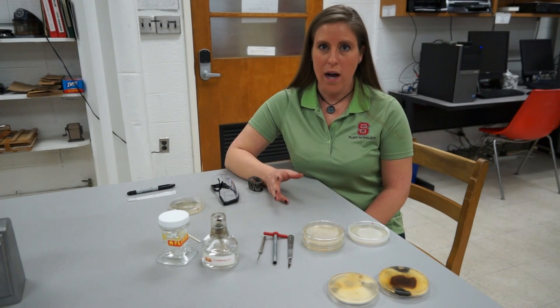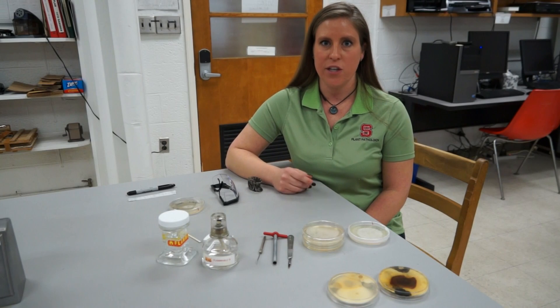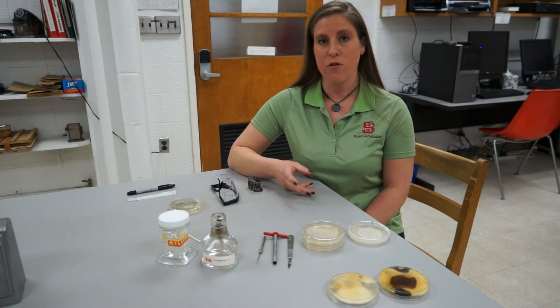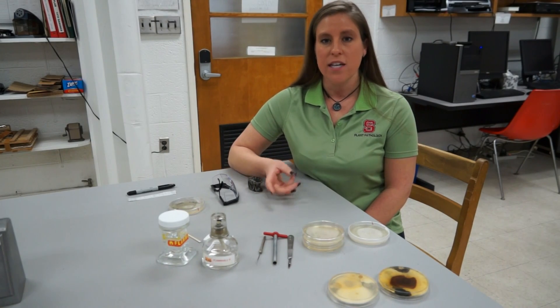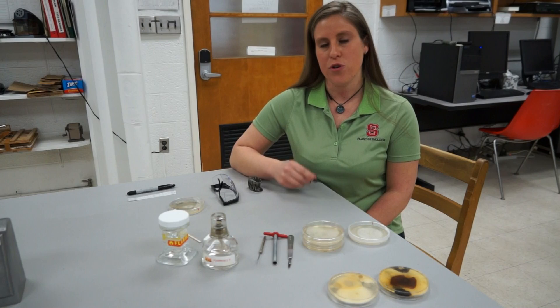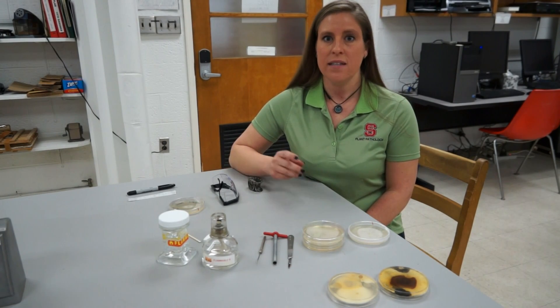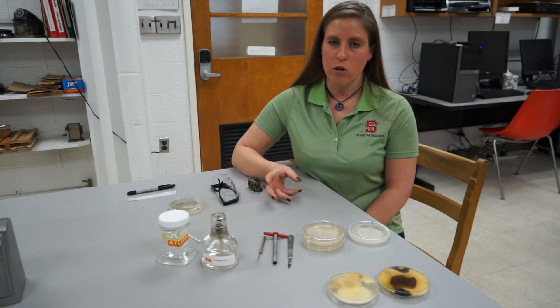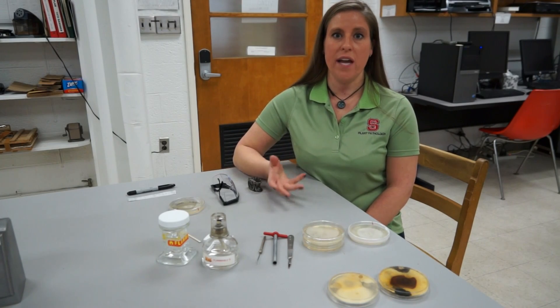Why are we transferring fungal cultures? When you perform experiments and work with organisms, you want to make sure that the organism you're performing your experiments with is actually the organism you're trying to test. You want to make sure that when you transfer your fungal culture, you use aseptic technique to maintain a sterile environment and keep your cultures pure.